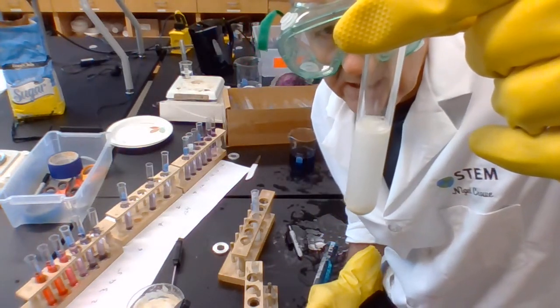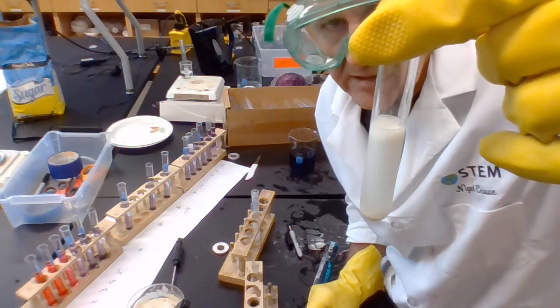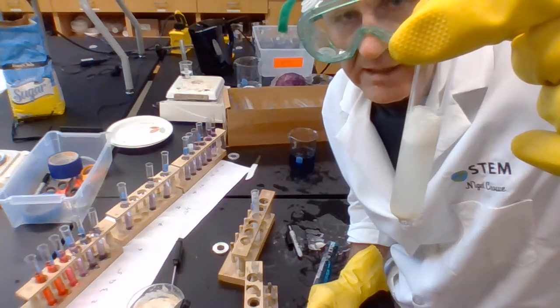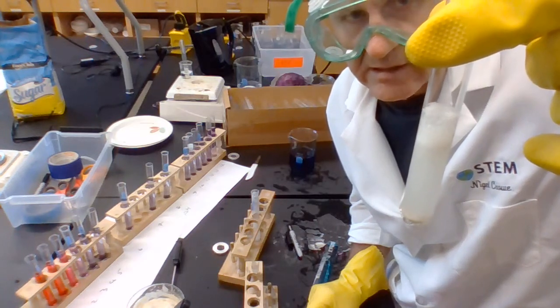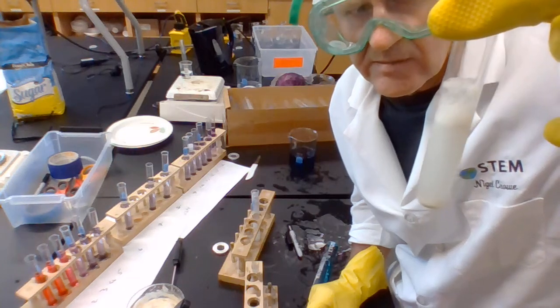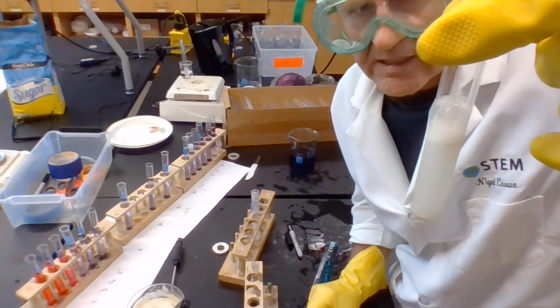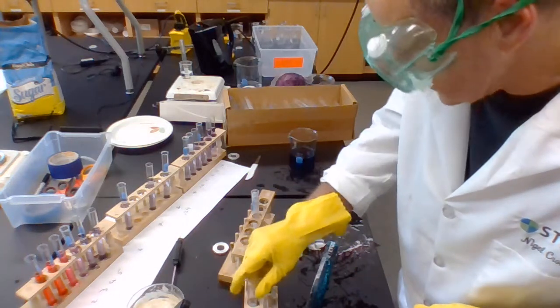It's doing a bit. There's about 5 millimeters, getting a bit higher. About 10 millimeters. It's working though. So this one at 12, 13 degrees Celsius, I think it's starting to go down now. It got to about 12 millimeters.